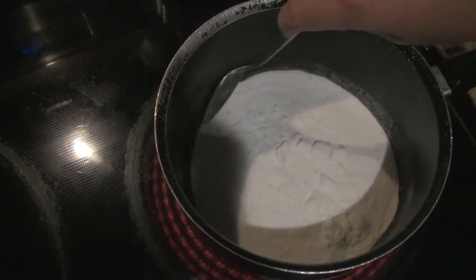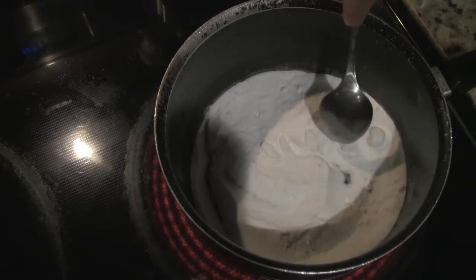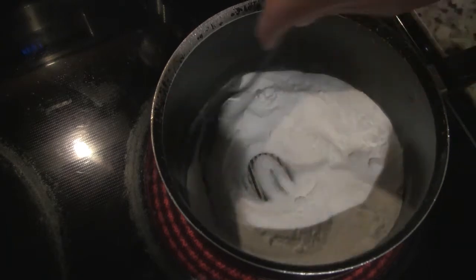Sodium carbonate is a water-soluble salt commonly used to make alkaline solutions. Shown here, I am heating 152 grams of sodium bicarbonate, otherwise known as baking soda, to allow for the following reaction to occur.